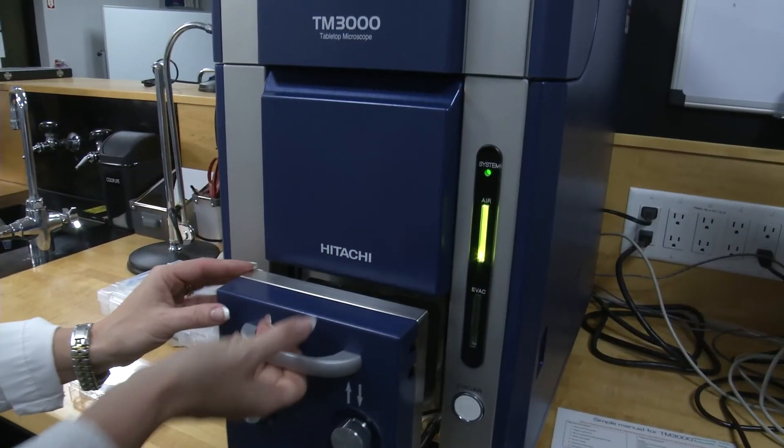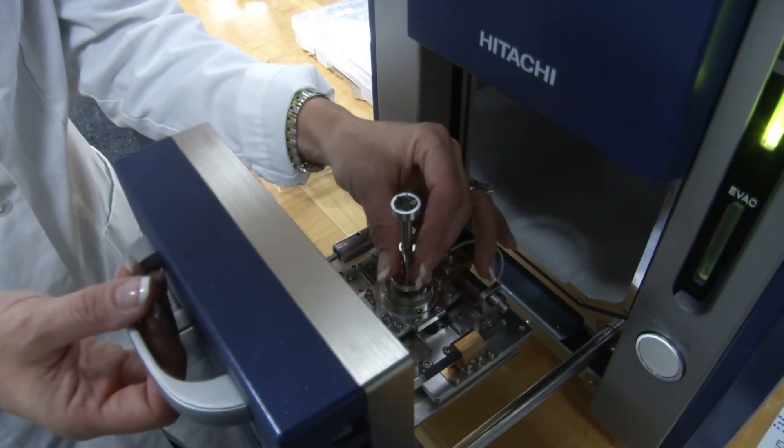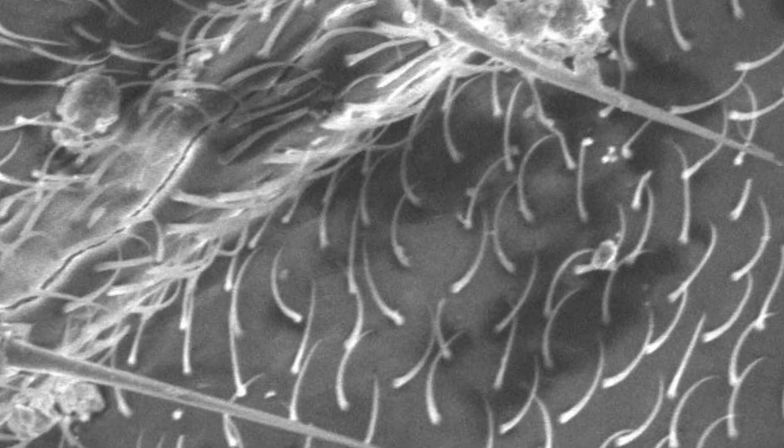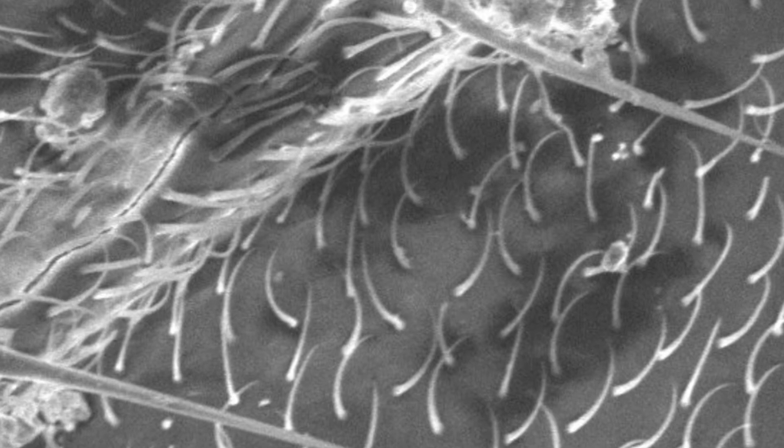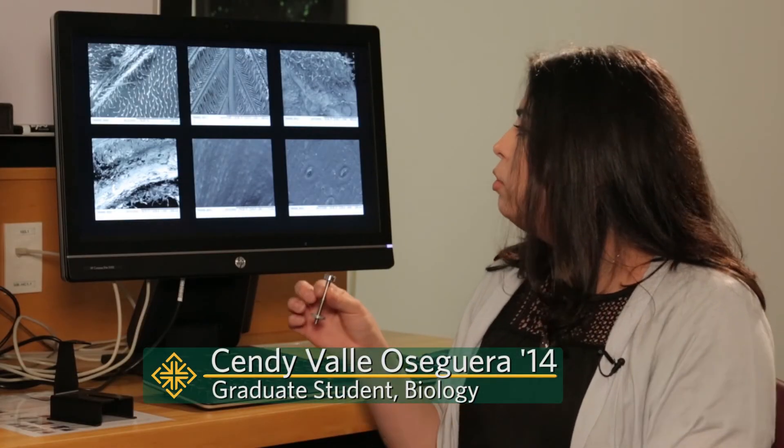This is a scanning electron microscope. It's a powerful tool which we can use to picture some really small structures. For example, we're here looking at various parts of an insect, the wings, parts of a leaf, and it allows us to look at those very close details and examine them.